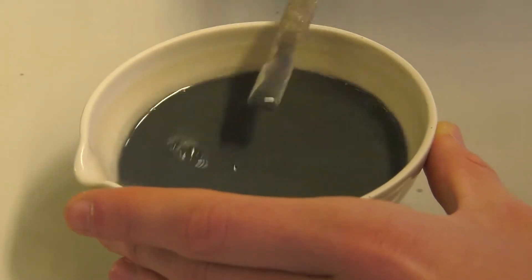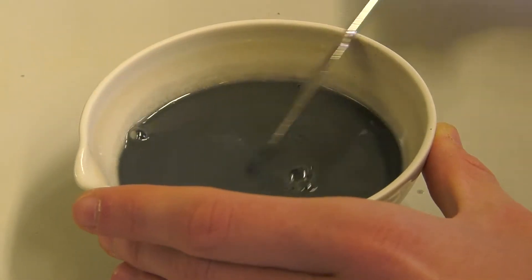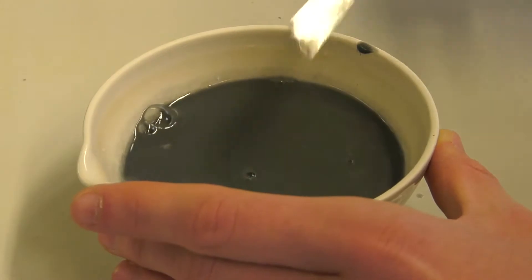Next, pour the sodium hydroxide solution and the 25g of zinc powder into the porcelain bowl.